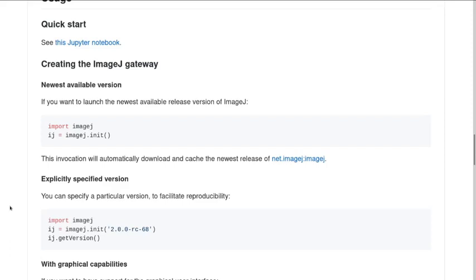But like I said earlier, you get the added benefit that you could do your ImageJ process inside your Python script, and then at the end, you can have a load of pandas data analysis, which instead of giving you a big CSV file with 100,000 lines from your multi-well plate high throughput experiment, just gives you the numbers that you're actually after from that experiment. It also makes it easier to share the way that you're doing something.